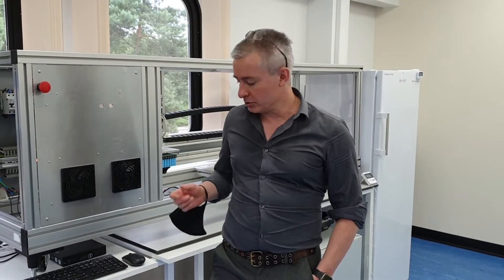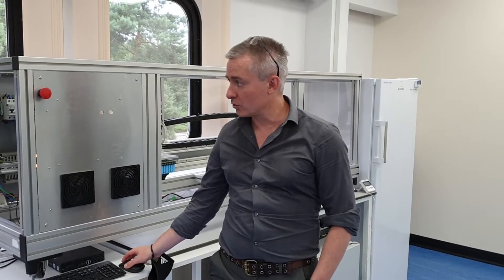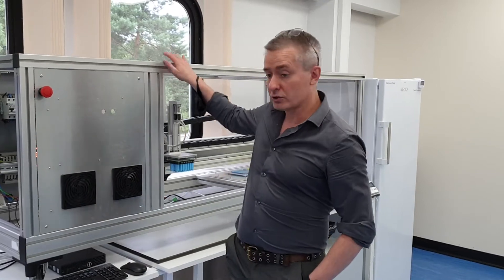Hi, good afternoon. We're in the ZP Coventry lab here near the university and what we're going to do now is I'm just going to quickly start a piece of software, but the software is actually driving this robot.